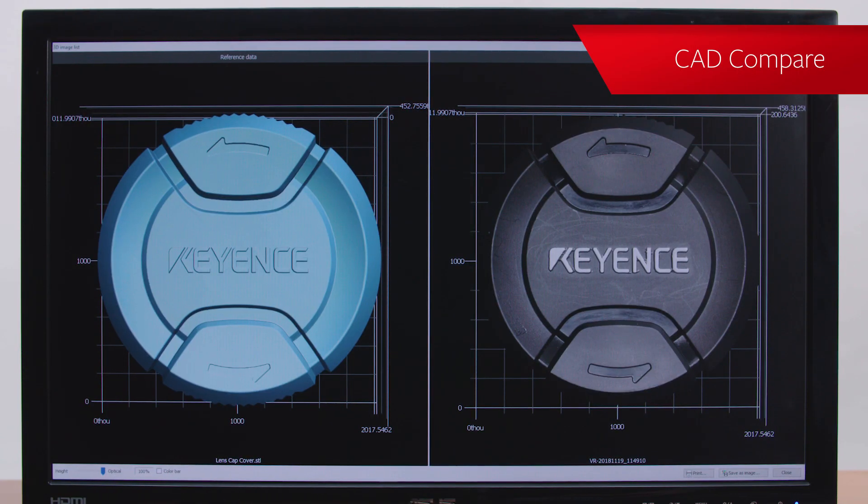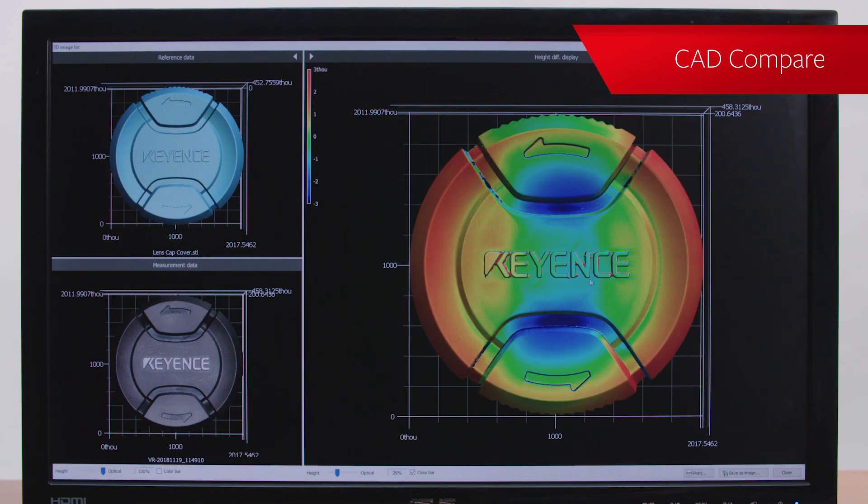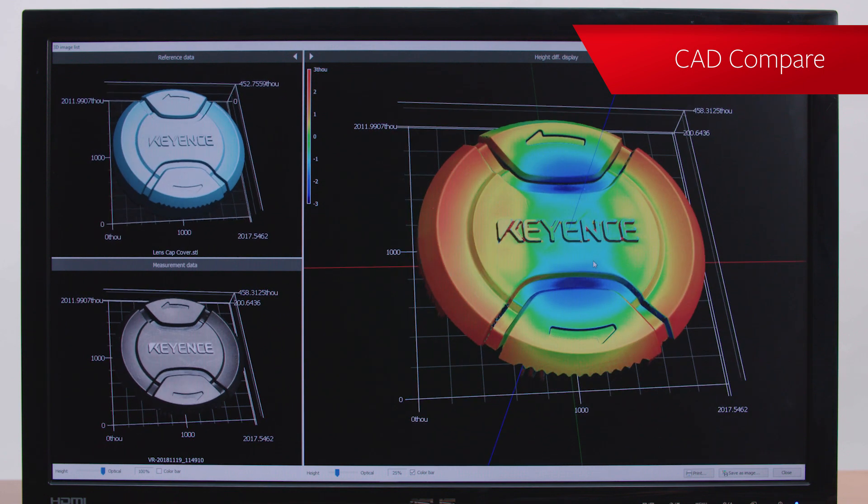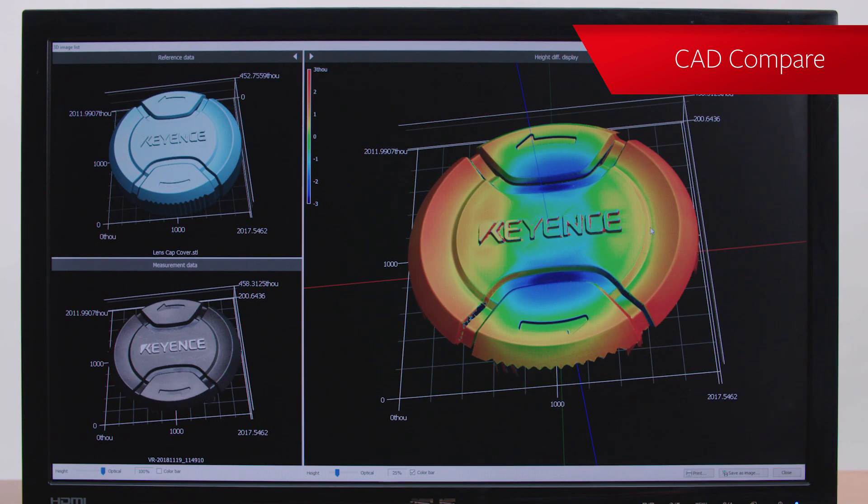CAD Compare can be used to overlay measurement data with CAD files, helping to verify product design and understand how a manufactured part will perform compared to the design.